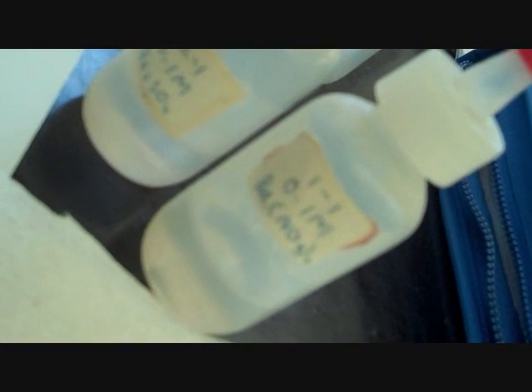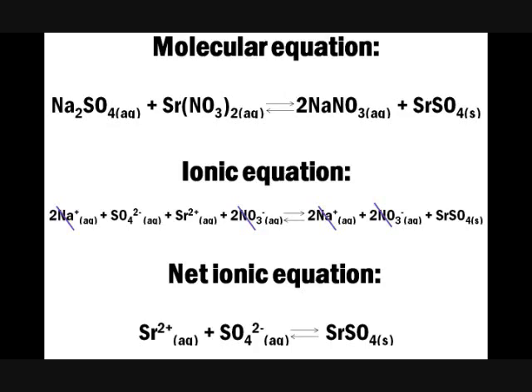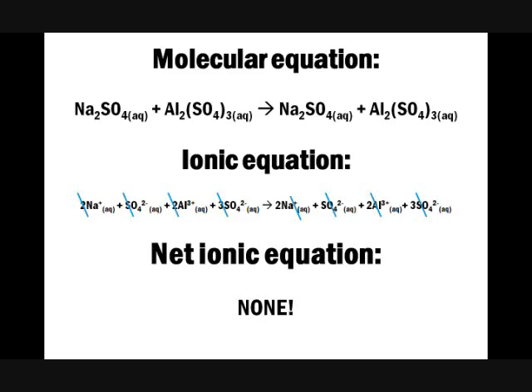and potassium chloride and sodium nitrate, and added barium nitrate and sodium sulfate, and it made white. Barium chloride and sodium sulfate, and it made added sodium sulfate and strontium nitrate, and this one, sodium sulfate and aluminum sulfate. It doesn't make this one precipitate. This is aluminum sulfate and strontium nitrate, and when we add it, we have a precipitate.